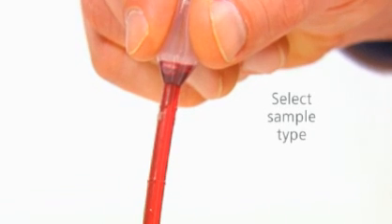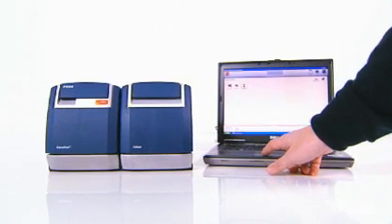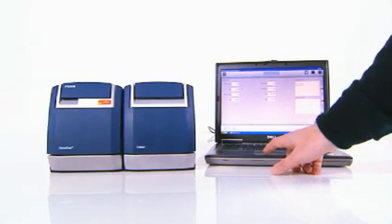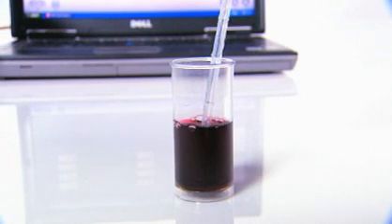To do a test for color and wine parameters, select sample type. Select an icon on the computer screen to match your sample type. In this case, we'll choose finished wine.